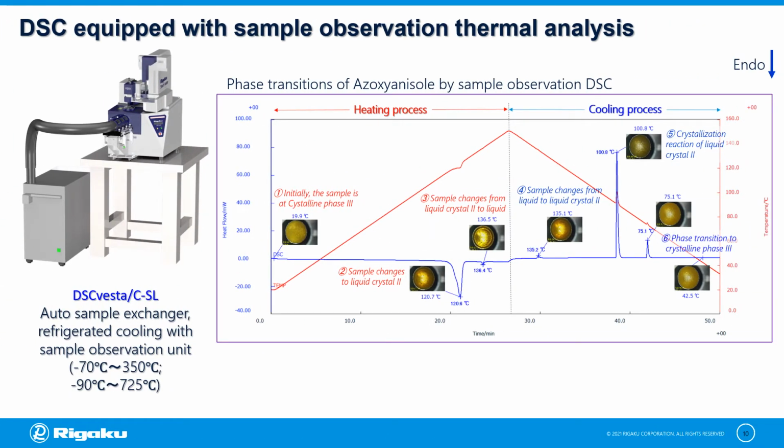For decades, we learned about the fundamentals of thermal analysis and thermal behaviors of materials. However, we cannot imagine the visual changes such as change in color, volume, loss of shape in a material as it undergoes a reaction. Recently, the use of sample observation camera in obtaining the actual images on the visual changes in a material associated with thermal behaviors is increasingly becoming significant because it provides new knowledge and information by direct observation.